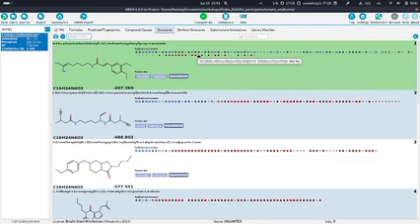So you should always keep in mind that you have all these different sources of information, and not believe every single score, but look at different things and see how they fit together. I think this is very important as a take-home message. So let's go into the structure tab now in detail.